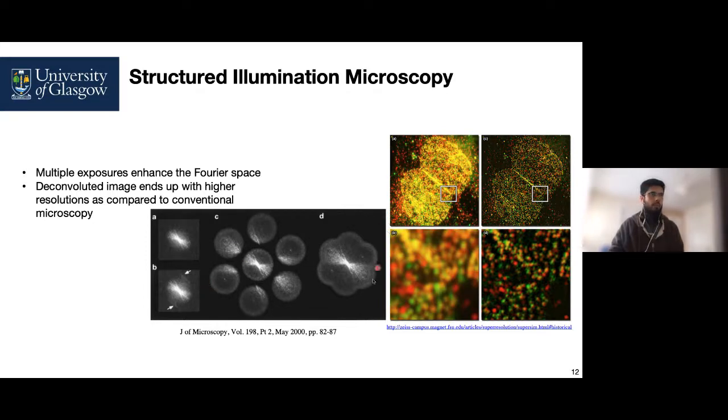In the black and white figure, we see multiple exposures in which we observe multiple frequency spaces, which are in the end convolved to make an effective larger frequency space observation.